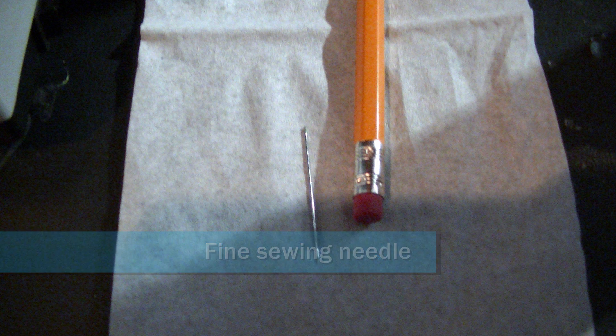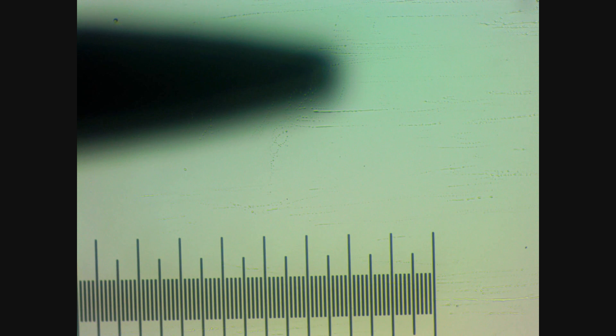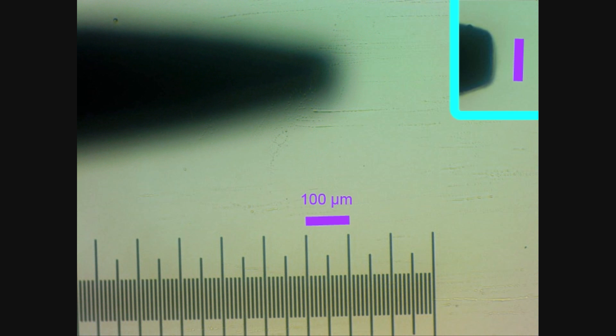Next up is a fine sewing needle. First, we're going to look at the eye of the needle. This is hard to get into focus with the calibration slide at the same time, because the needle is so high in the air relative to where the gauge is. But as you can see, it's approximately 1 mm long and a quarter millimeter wide, 250 micrometers. The pin is even harder to get into focus with the slide because it's much finer and much more elevated in the air. The tip of the pin here is approximately 100 micrometers.